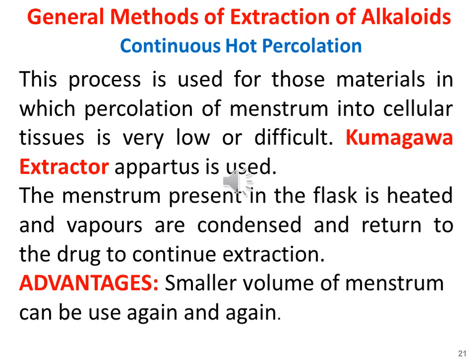Solvents with a polarity value near to the polarity of the solute are likely to perform better and vice versa. The greater the solvent to solute ratio is, the higher the extraction yield is. However, a solvent to solute ratio that is too high will cause excessive extraction solvent and require a long time for concentration. The conventional extraction methods, including maceration, percolation and reflux extraction, usually use organic solvents and require a large volume of solvents and long extraction time.